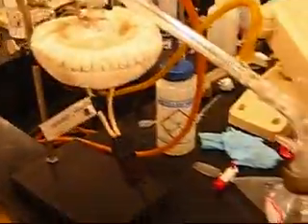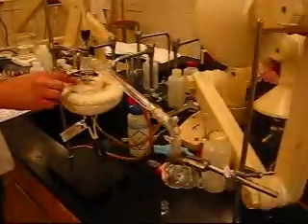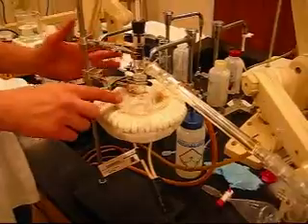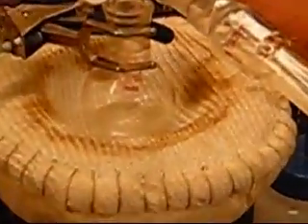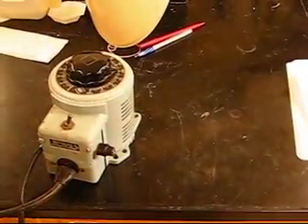Okay, now we are ready. So now we're ready to distill. All we first do is turn on the condenser, flow the water through by turning this faucet on, and then we turn on our heat.